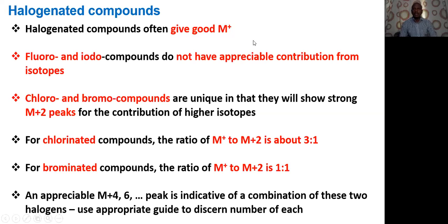Till now we have discussed the interpretation part. That is alkanes: how you interpret the mass spectrum of alkanes, what the prominent or significant fragment ions are, and how you can identify them. Then alkenes, and alkanes, straight chain and branched chain, we have discussed. Then cycloalkanes also. In case of alkenes, straight chain or branched ones, or cycloalkenes, that also we have discussed. Alkynes also, and later we discussed aromatic compounds, their prominent peaks, and the determination of those peaks.